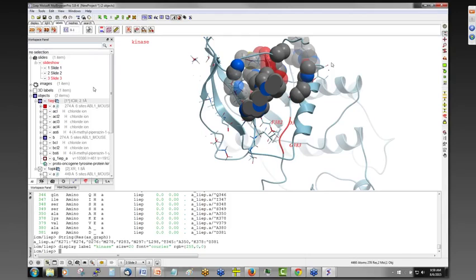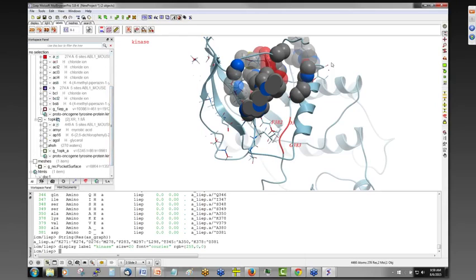It's still kind of in development because we have a way of viewing a stack of conformations, and I think you may have to wait a couple of weeks really. It needs to be tested, but it should be available soon.